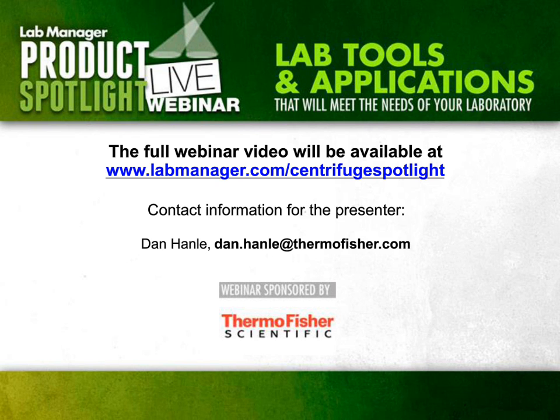The other thing to ask, and this is where the fun factor comes in when dealing with customers who are looking to buy new, is you can now think of it differently and say, what's more valuable to me, my bench space or my floor space? And when you do that, it gives you some options maybe you hadn't thought about. So sometimes people go with floor-standing benchtops, like the one I mentioned, because the bench space is critical to them, and they don't want to use it up, but they still want that capability.